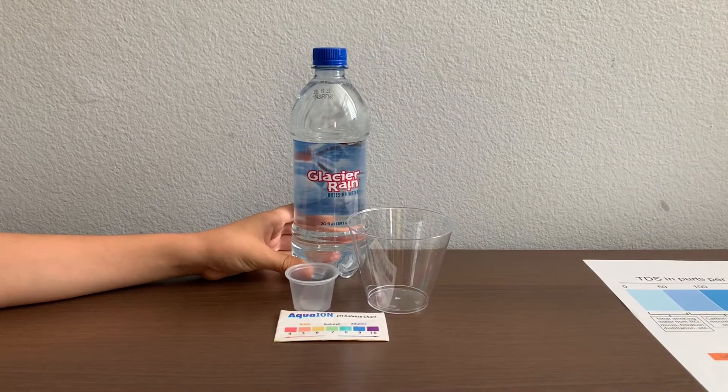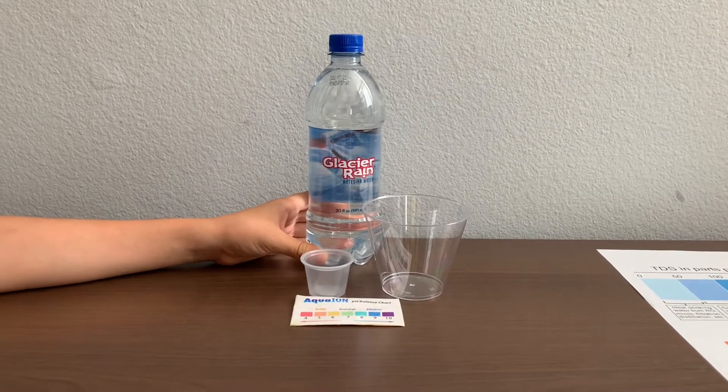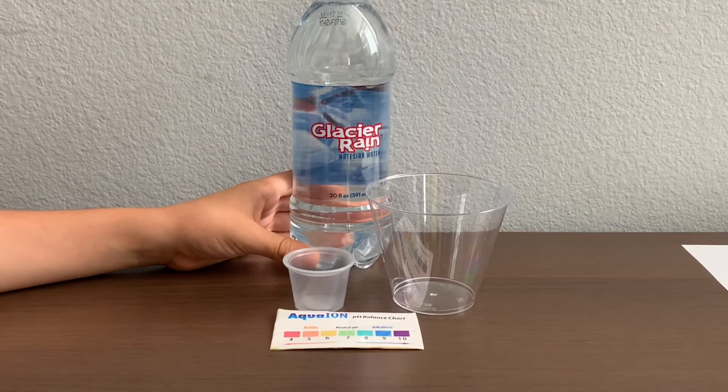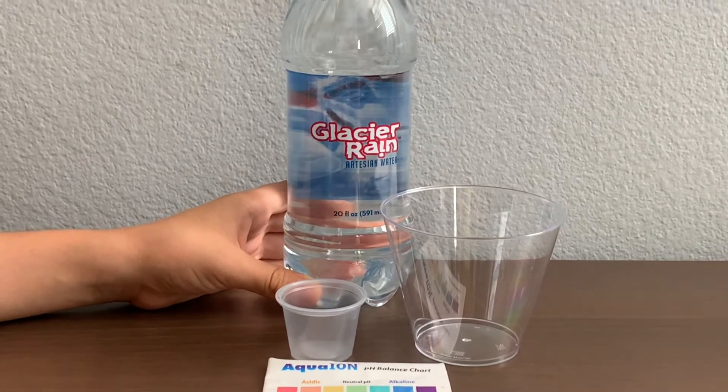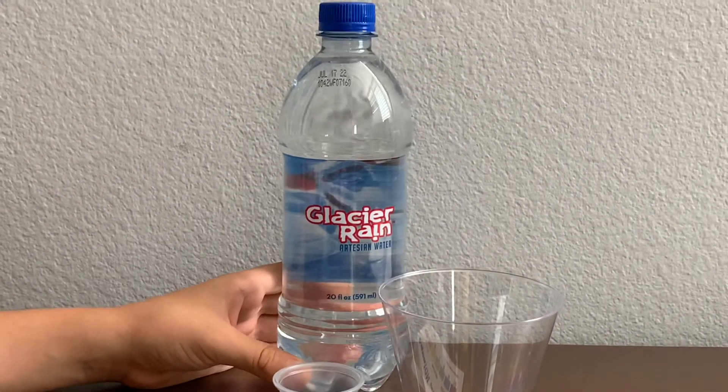This is Glacier Rain Artesian Water, sourced from Worland, Wyoming. It's sold at the Maverick Market in Arizona for $1.29. Let's test the pH and TDS levels.